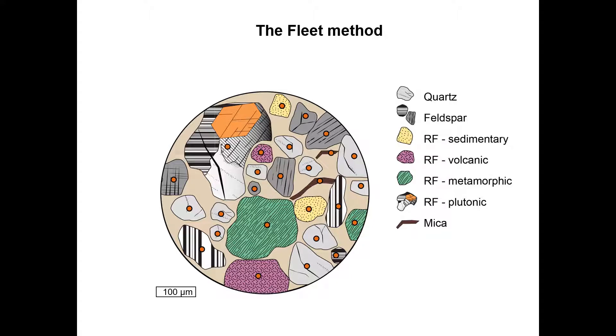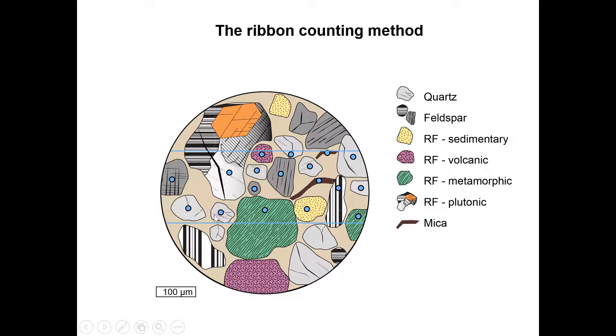A variation of the fleet method is the so-called ribbon counting method. Here you count all grains that are contained within a small band, the ribbon, of the thin section. The width of this ribbon depends on the grain size of the sample.